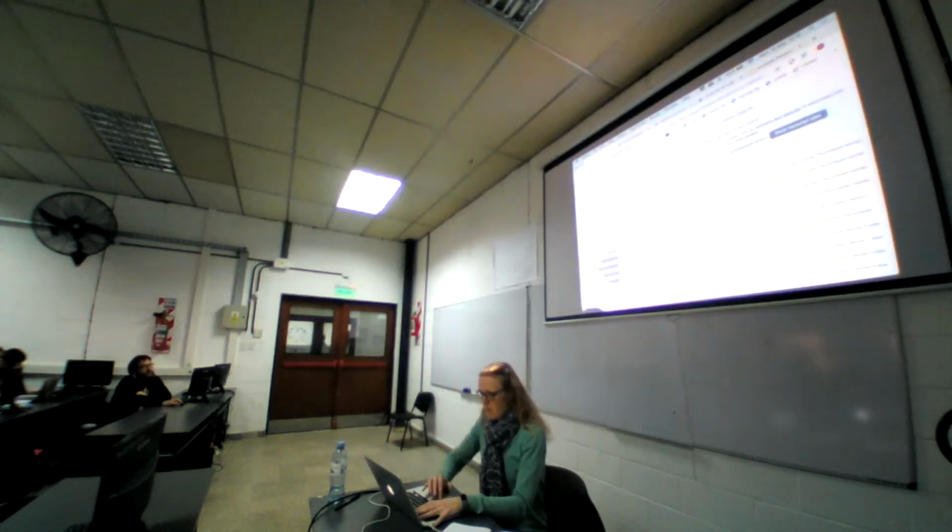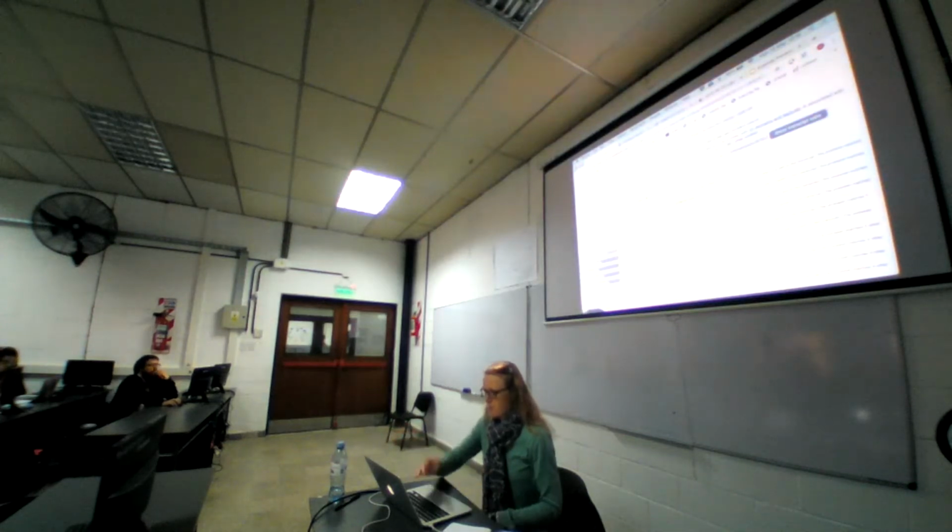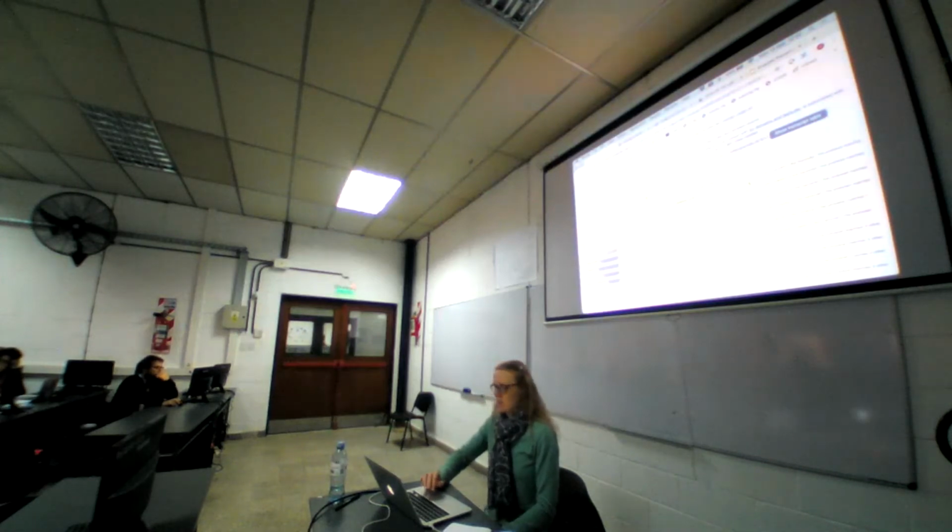And on this page here, you can see now, for example, from this array here, this probe here was mapped to this transcript, and it also maps to some other transcripts, which you can explore here if you like.